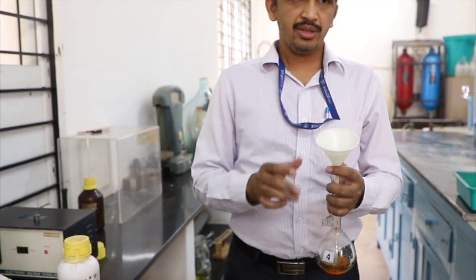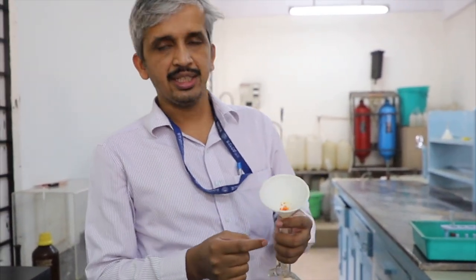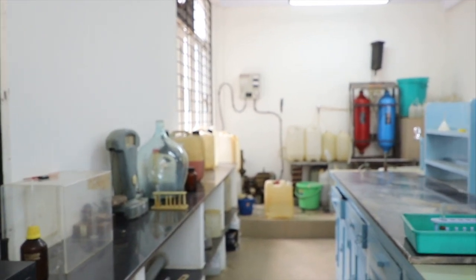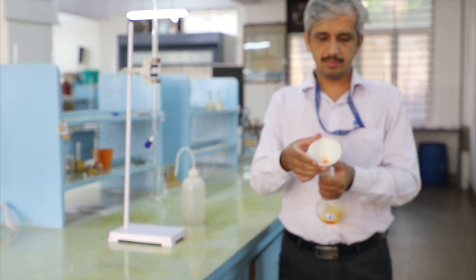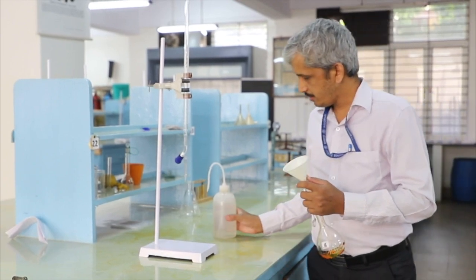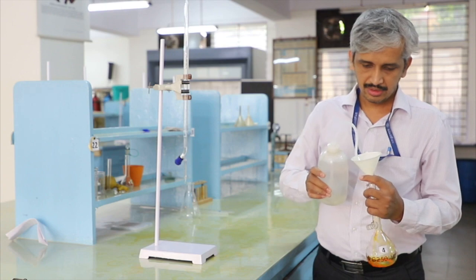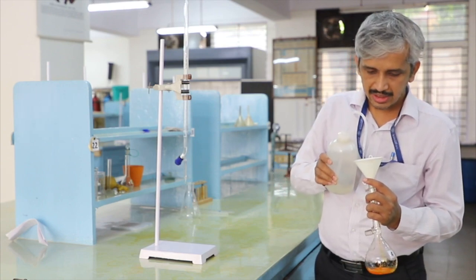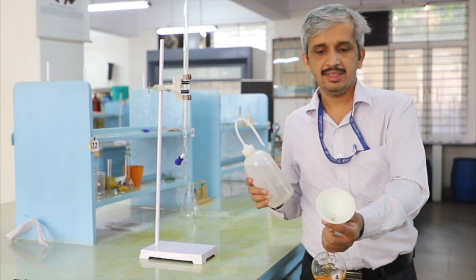So now if you see, there are certain crystals sticking to the funnel, so they have to be washed down. So you can add water. Now you can see here the funnel. In the funnel we have some amount of potassium dichromate sticking. So it can be washed down now, using distilled water. To make sure that no crystal is sticking to the funnel, we thoroughly wash it down. So you can see there is nothing inside.